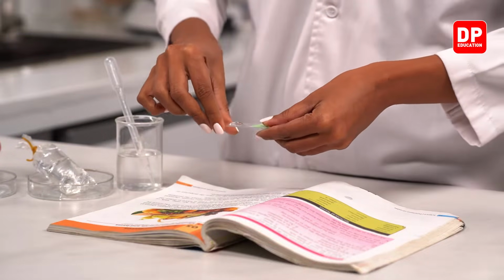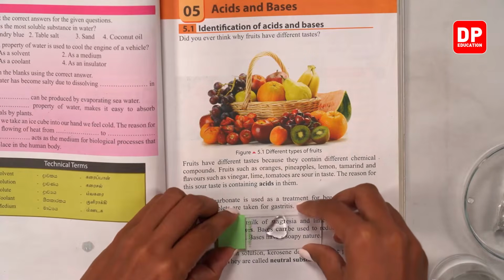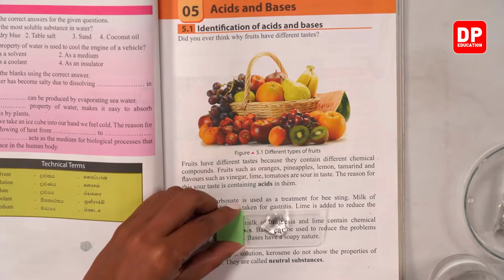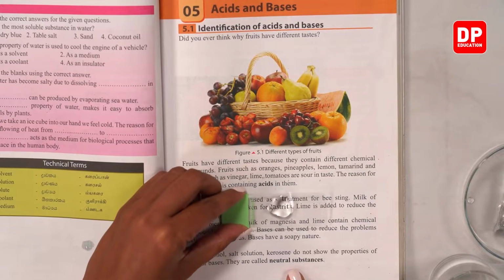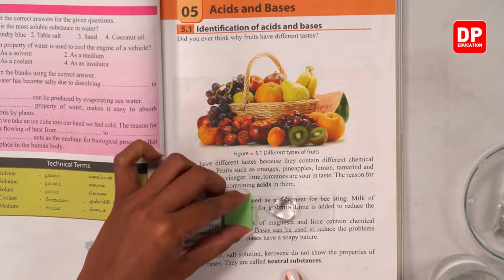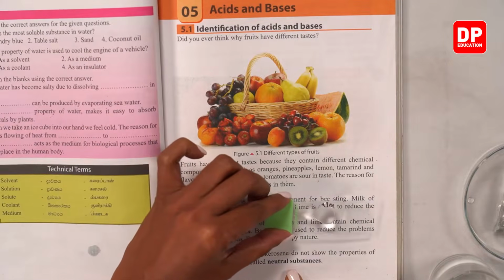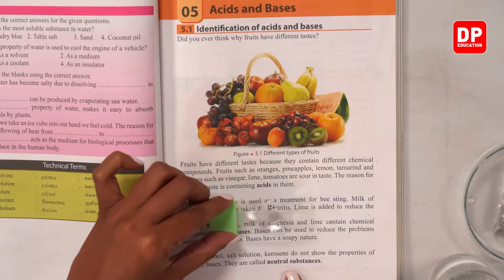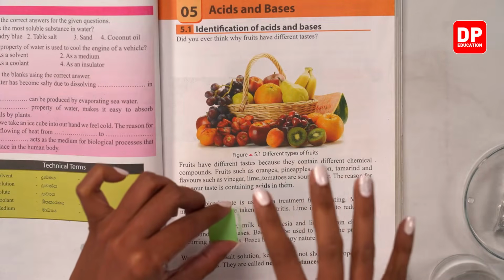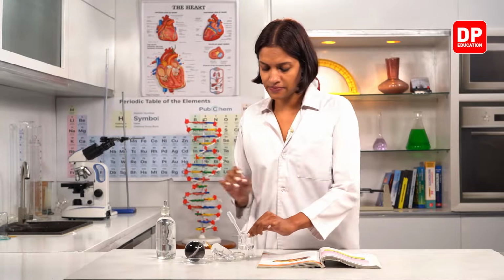Right. Okay, children. Now look at this one. You all can see the place where this drop of water is present, the letters are bigger. Can you see? Observe very carefully, children. Here. You all can see. When I move this one, it's very clear that the letters are bigger than before. Right, children? So using only the glass slide, we can't observe bigger letters. When we place a drop of water on this glass slide and look through that one, we can see bigger letters. Right?